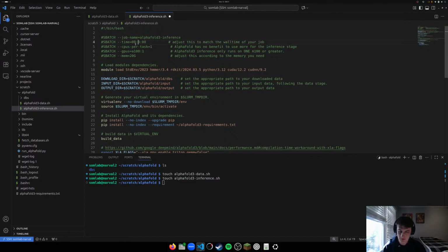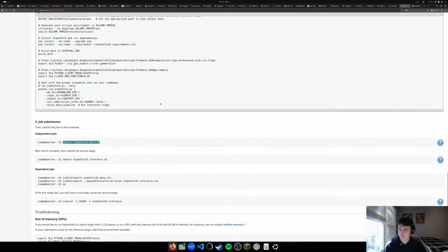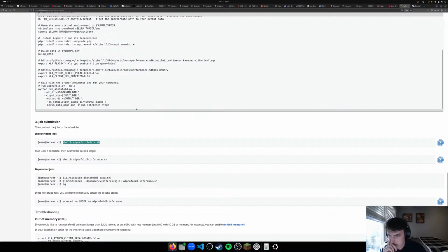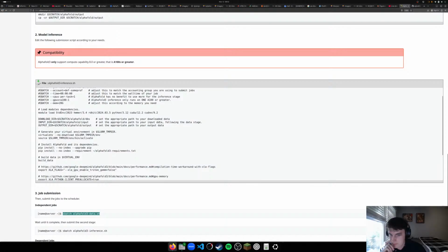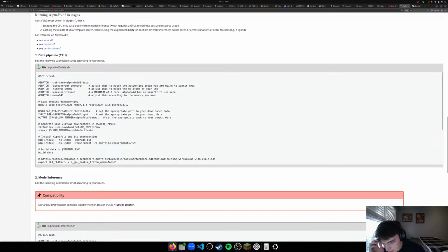Set it to, probably this would be like 20 minutes maybe. I wish I could give you an example job. So does this require input? Yeah, it does. Okay, so what we need to do is input just a directory. Looks like it.